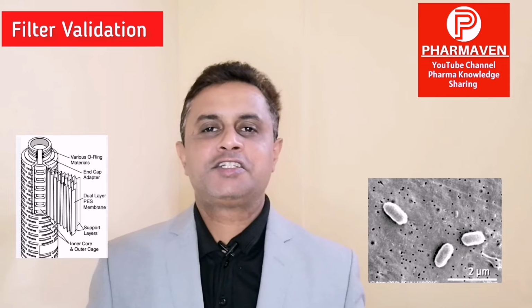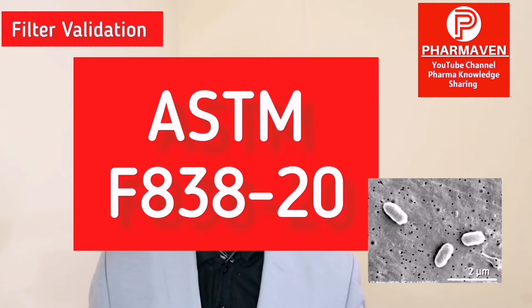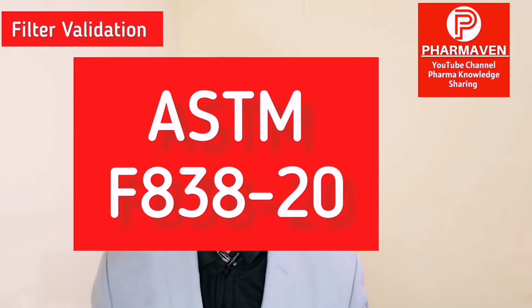The test for this is called the bacterial retention test. It is as per ASTM F838-20 as well as PDA Technical Report 26. It defines the method for how we can validate the filter through the bacterial retention test. So let us understand how we can do it.